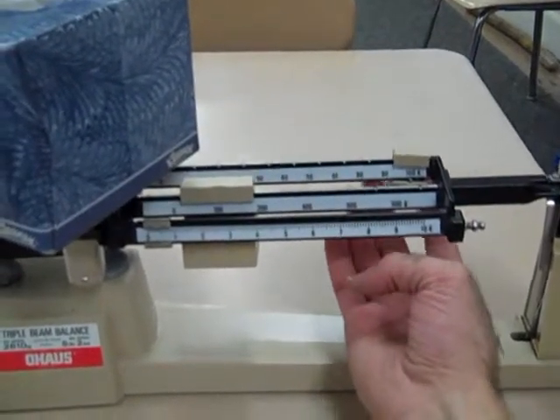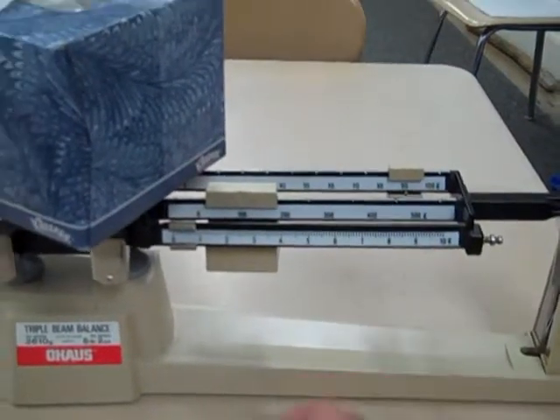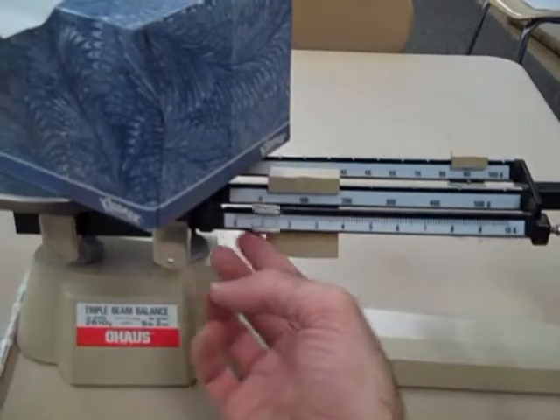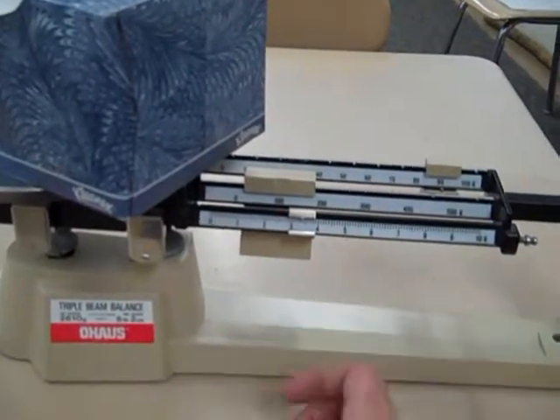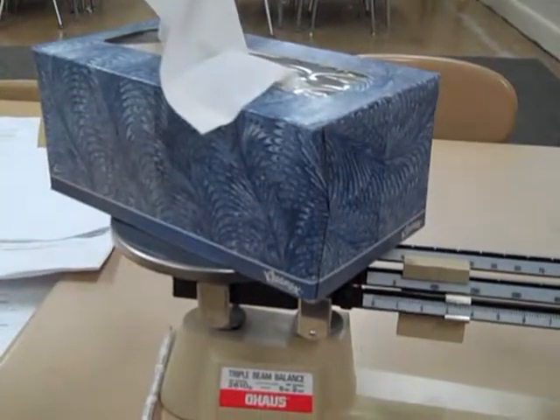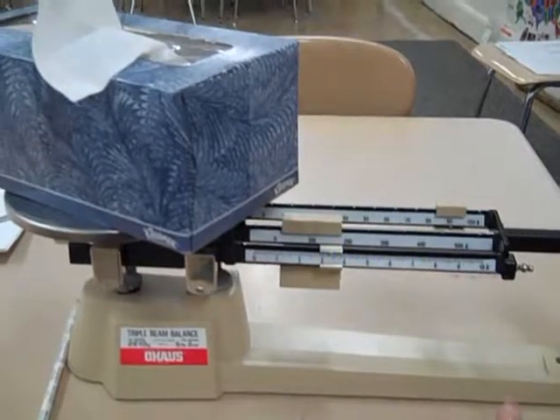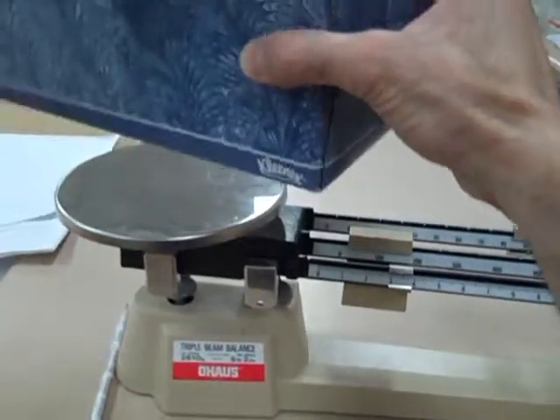That's a little too much. Let's go to the 90. So it looks like the box of tissues, so far, is 190 grams. Let's move our ones over. And there we have it — this box of tissues has a mass of 193 grams.